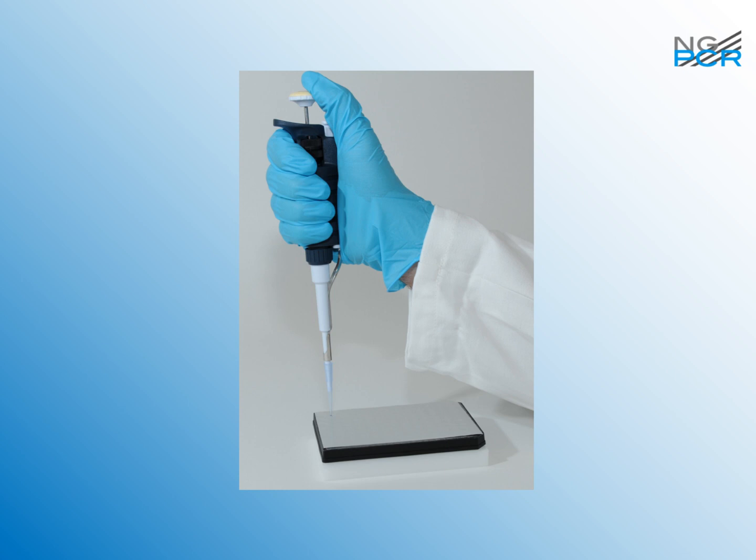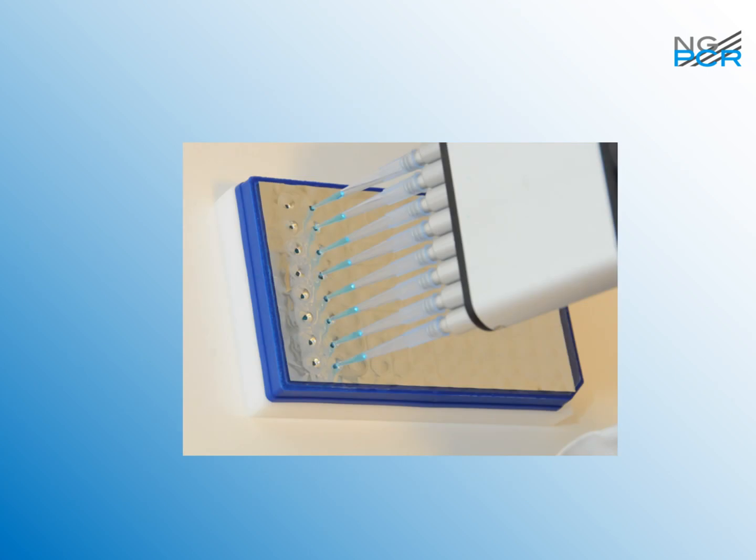And the heat seal is, in this case, a sheet of thin aluminium on the top side. So you can use heat to heat it up without sticking to the heating block. And on the other side, the plate side, is a thin layer of polypropylene. There are also clear seals that we can use. They are polyester on the top side and polypropylene on the bottom side. These tips will also stick through polyester seals. And then obviously you can also do that using an 8-channel pipette, and you can see that here it empties 8 wells at the same time.